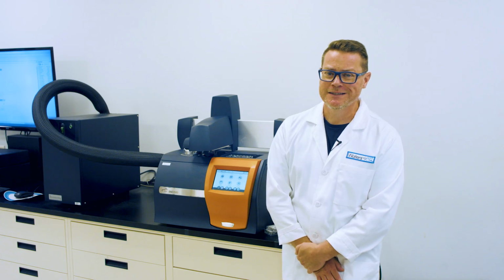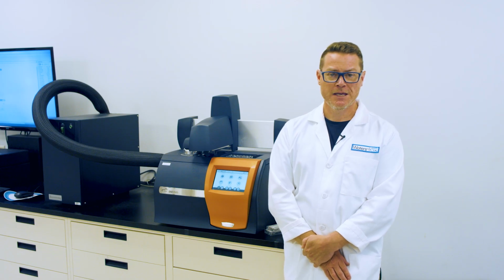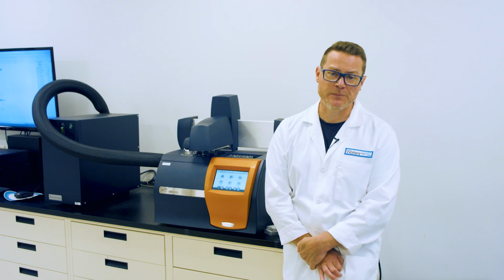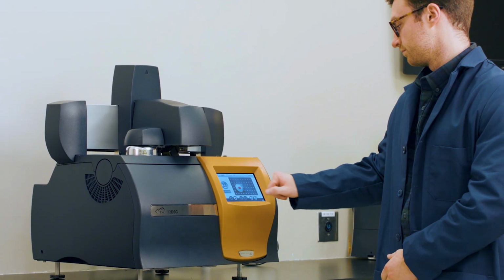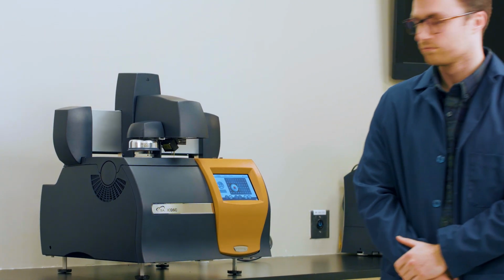Usually, but not always, the heating rate is constant, say 10 degrees per minute. It's important to choose the heating rate carefully so that you interpret the results properly, and the heating rate doesn't have to be linear. Once the DSC has these values, it has all the information needed to start an experiment.